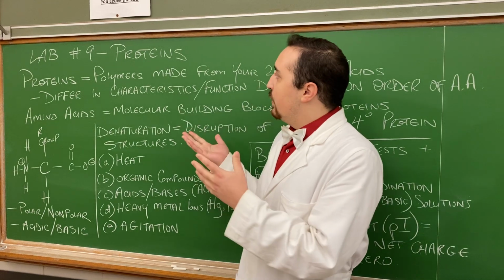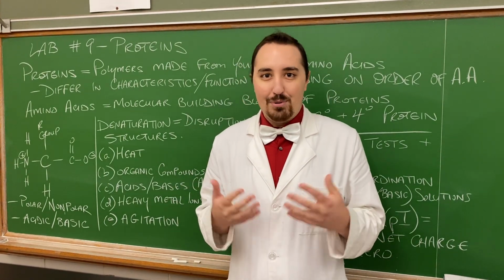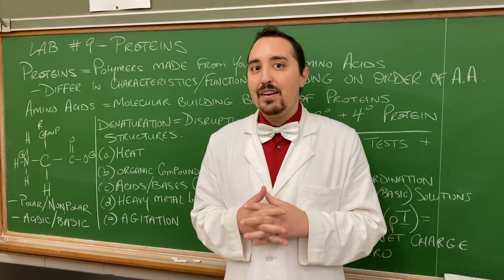So what we're doing in this lab, we're going to look at different parts. We're going to look at different pieces of proteins. Denaturation, we'll talk about what that means in a second. You're going to check out the observations in the different videos.